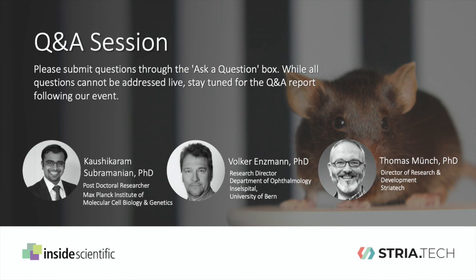Okay. Volker, can you share any best practices from your work? Yeah, of course. I have actually two personal tips. First of all, it helps to place the animal on the platform without showing a stimulus the day before, even if it is just for 2 minutes. And then secondly, in our experience, doing the measurements in the morning instead of the afternoon is also very helpful to measure faster and more reliably.